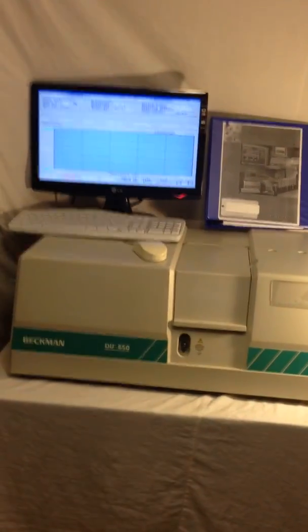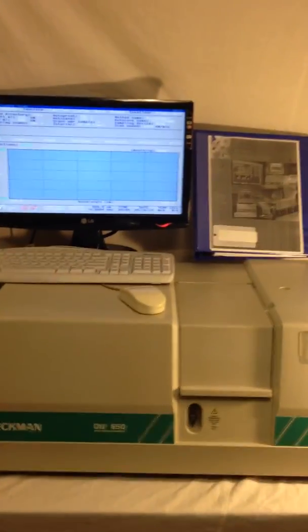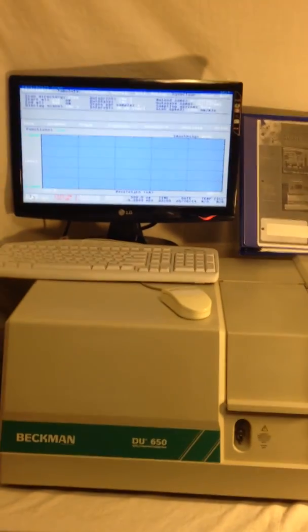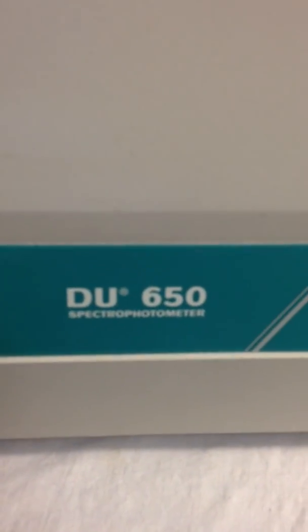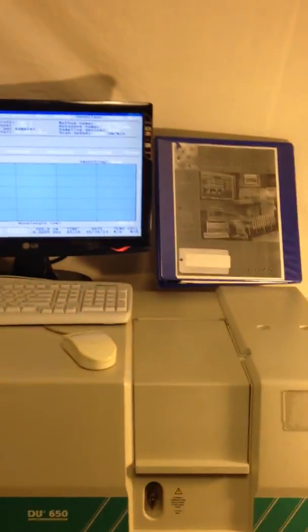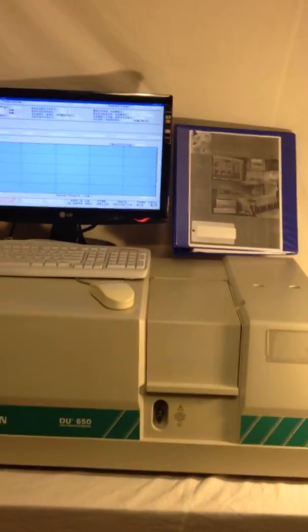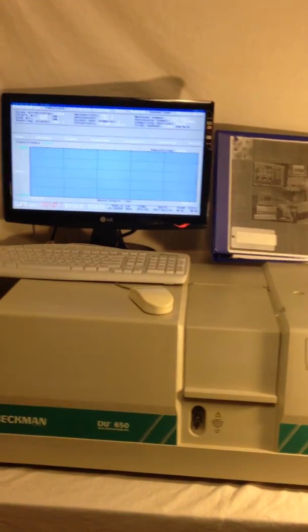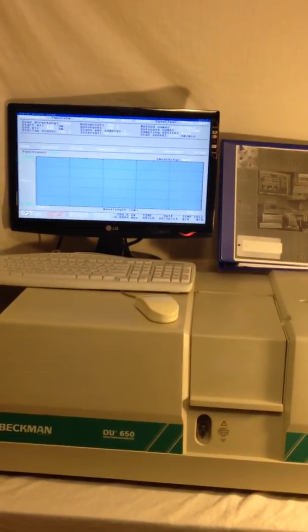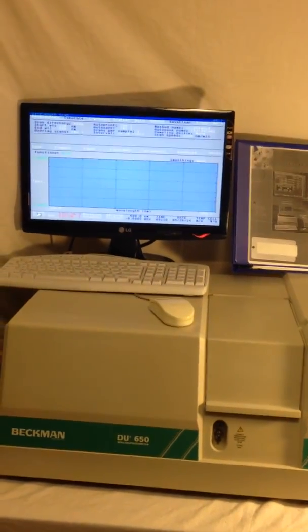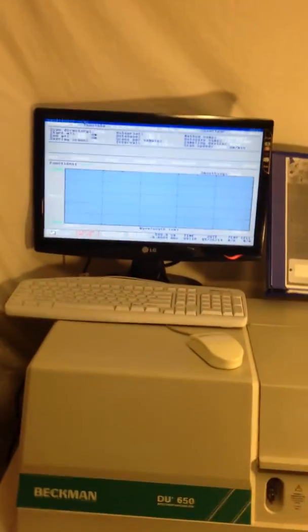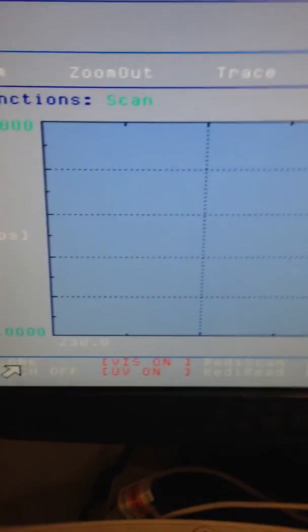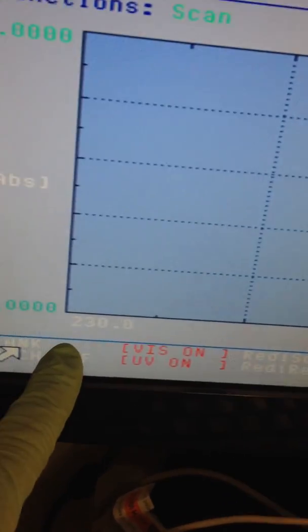Hello, you're looking at a Beckman DU 650 UV-visible spectrometer. We are testing the performance of this instrument with sodium chromate, which has an absorption region between 230 nanometers to 500 nanometers.